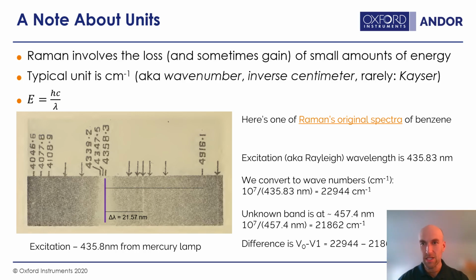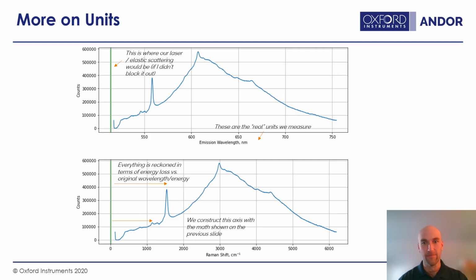Now let's see if I can show this a little bit more clearly on an X and Y spectrum. Those guys did a lot with photographic film, but it can be hard to read the intensities on there unless you're just very good at looking at differences in white contrast. So here's one spectrum. This is a resonant Raman spectrum with some fluorescence left over. Green is where we're exciting, and I've gone to great lengths to block off that laser beam because it's so much stronger than the Raman spectrum that it's creating.